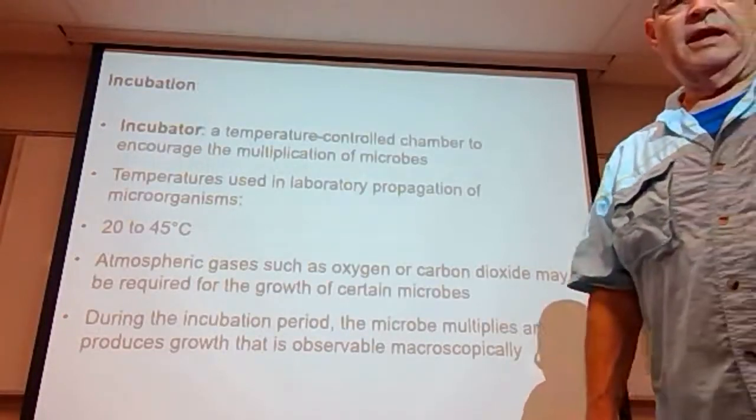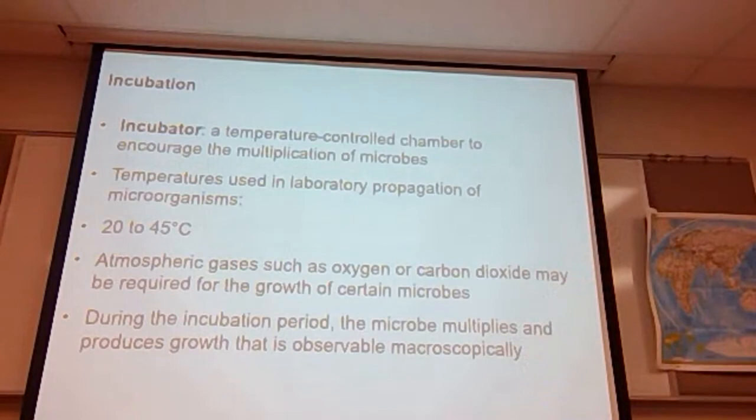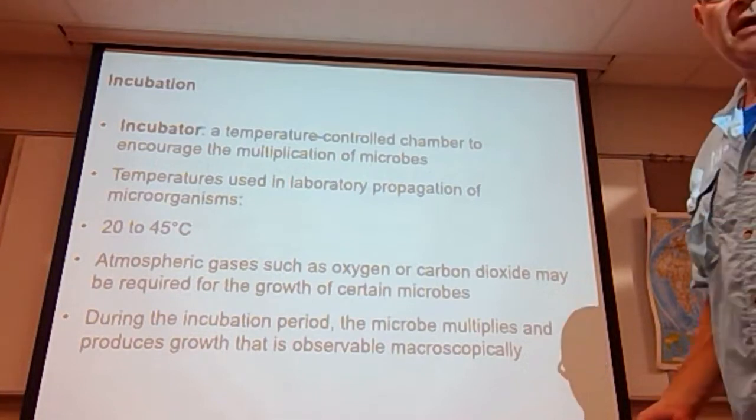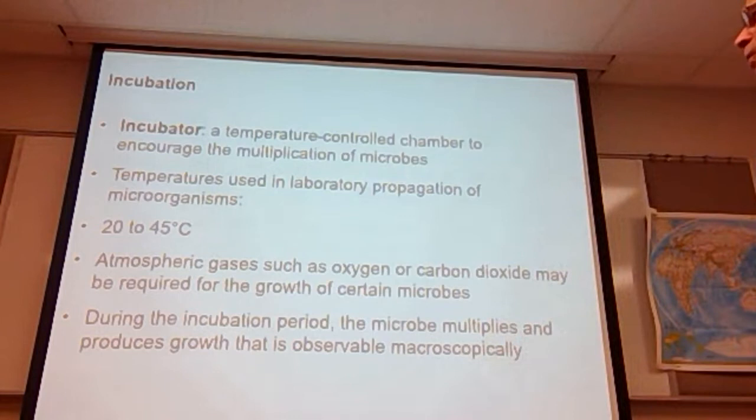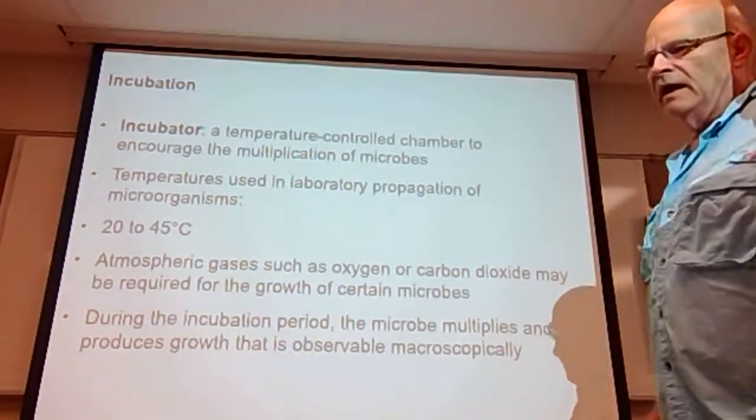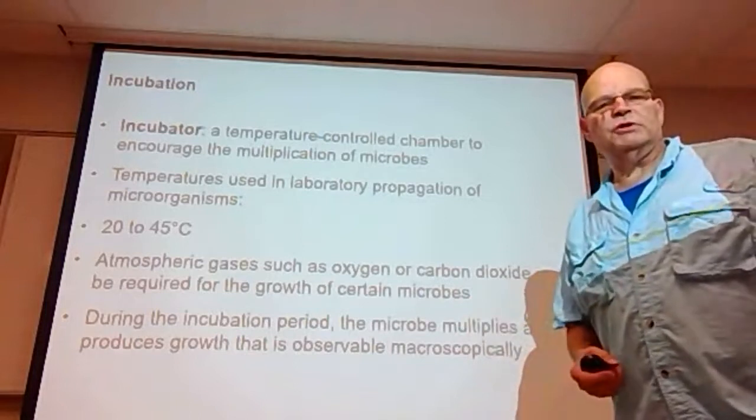Incubation is done in an incubator. Incubators can be very simple structures. The ones we have on our campus are about half the size of a refrigerator or so, but they are temperature controlled. These are used to grow bacteria. They can be set at a variety of temperatures.